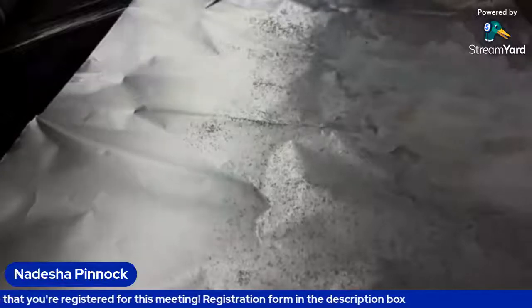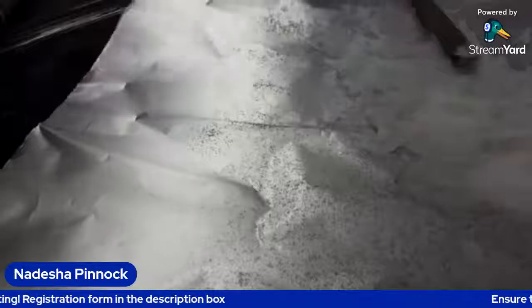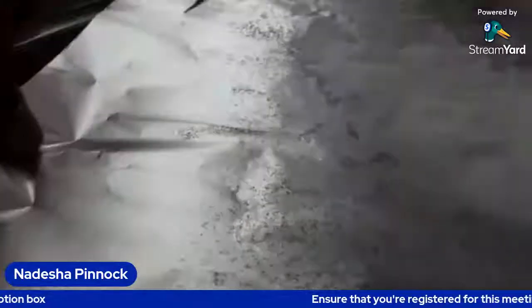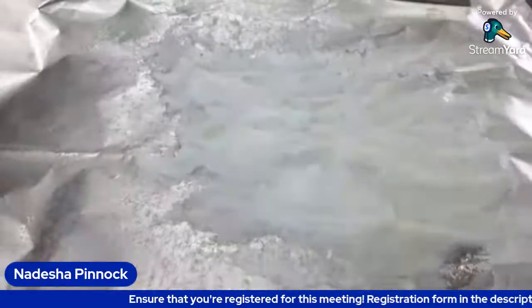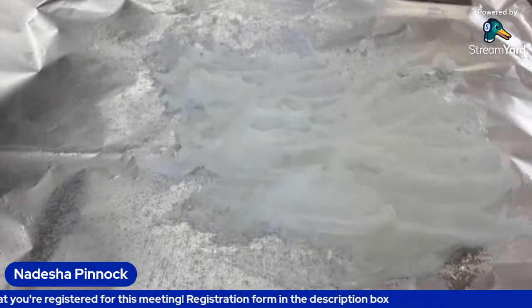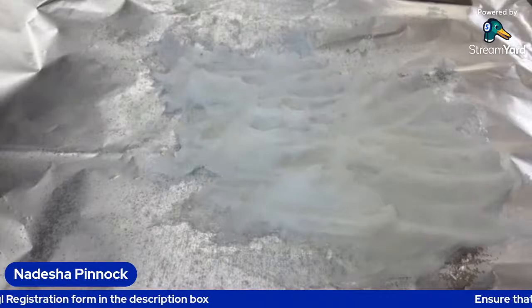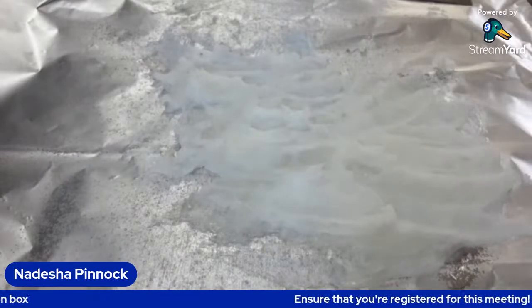Alright, so right now it's kind of warm. So you guys are seeing. Yeah, there we go. So it's a bit warm. We're allowing it to dry and see what our product looks like.